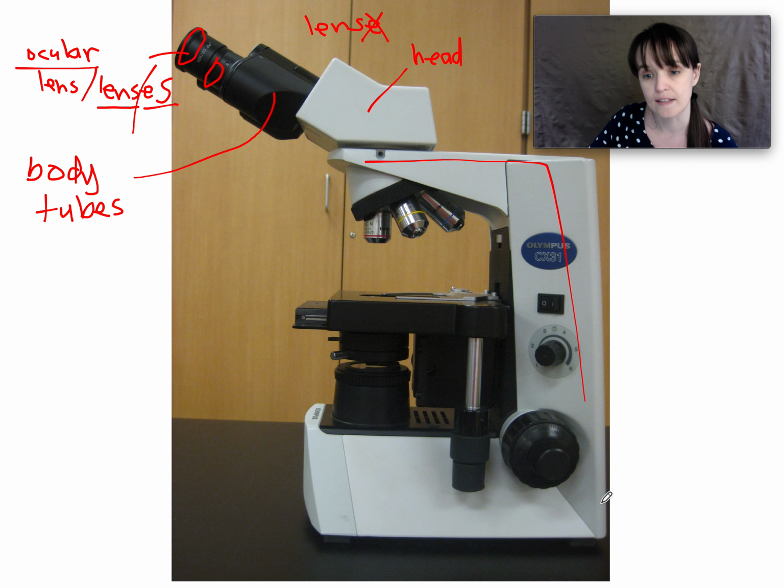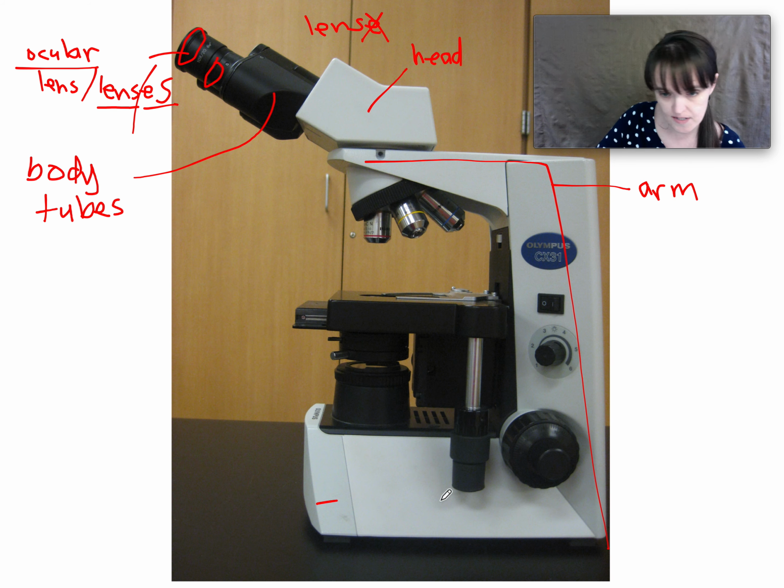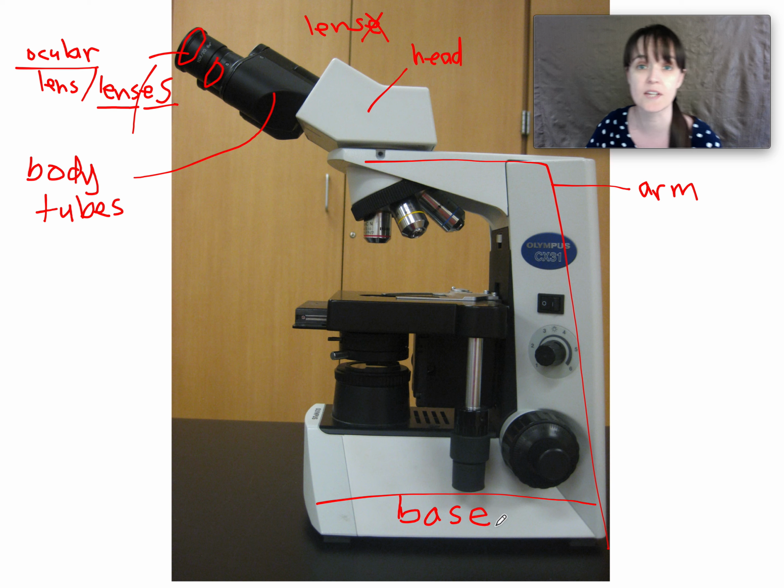And then this part, and on some of them it's round, and this one's got more of an elbow, is the arm. And the base is the part sitting on the table. And again, I know my handwriting is terrible. It's both doctor's handwriting and writing with a mouse.